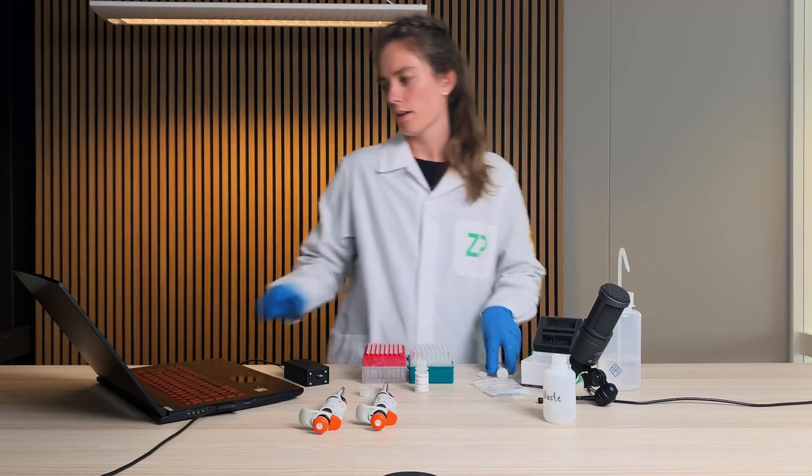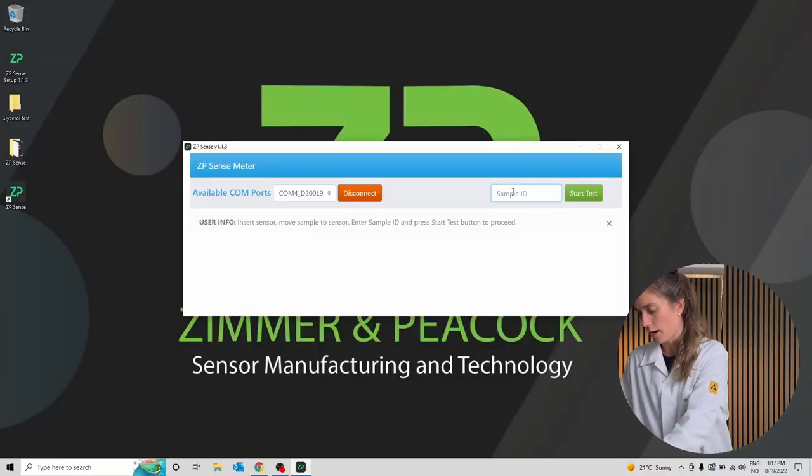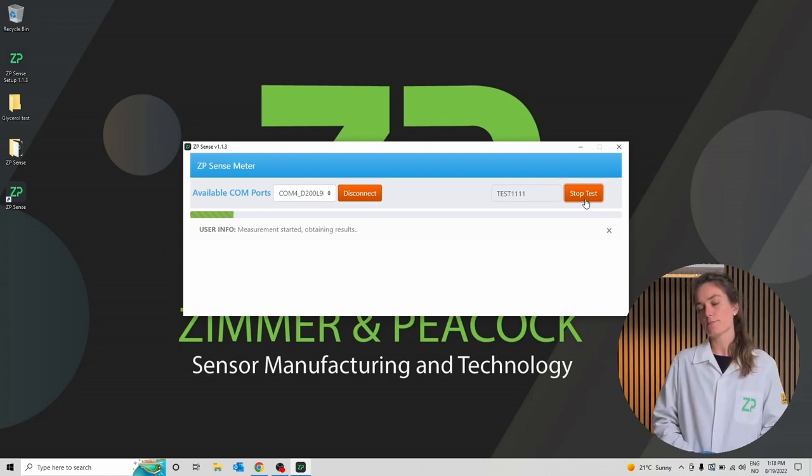Now that this is completed, I will add a sample ID. It needs to be a minimum of 8 characters — I will call it test 1111. I will start running the test. This is the first measurement out of two measurements. What it is doing now is polarizing the sample, which is a pre-treatment of the sample itself. Afterwards we will activate the sample. This measurement will take about two minutes, so in order to save time we will speed up the video.